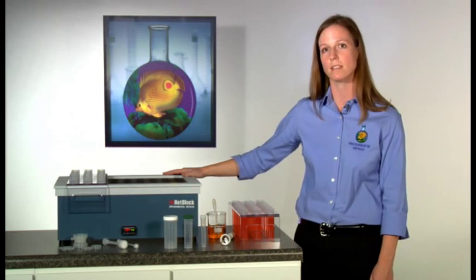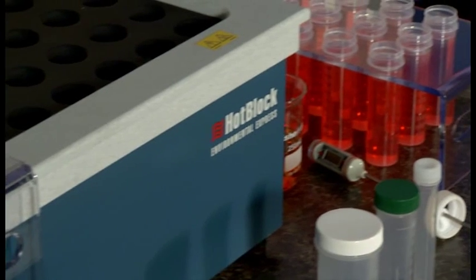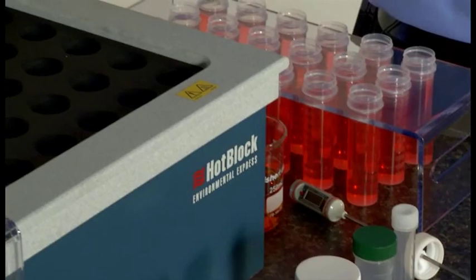Each block is small enough to easily fit in a fume hood while large enough to accommodate 25 to 96 samples depending on the needs of your laboratory.